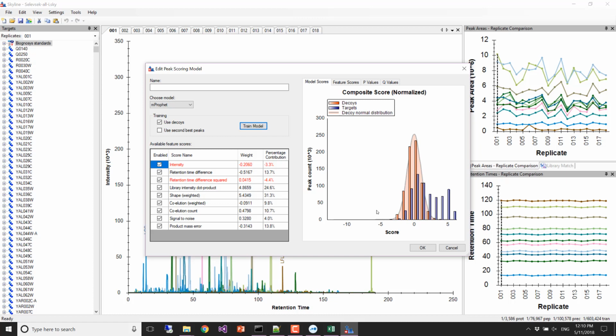But the people who would have us do this would contest that, okay, these Q values are going to screen out all the things that you couldn't measure, and so you don't need to do the CV. The statistics that we apply on this full data set will be sufficient to screen out peptides that would be problematic, and therefore we can just take whatever is detectable now and put it into the statistics.